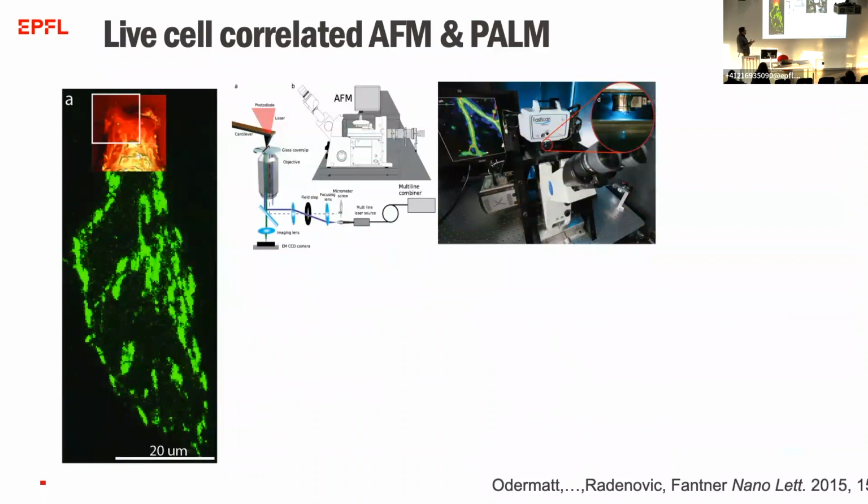And this actually is the first work in this area where Aleksandra and I started to work together, because I came from the scanning probe AFM side, and she was doing great work in super resolution optical microscopy, and we were both trying to push towards live imaging at high resolutions, but from two different directions.